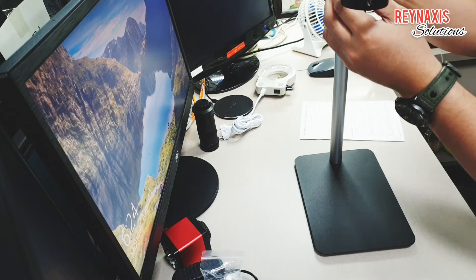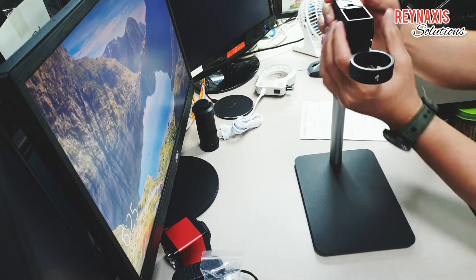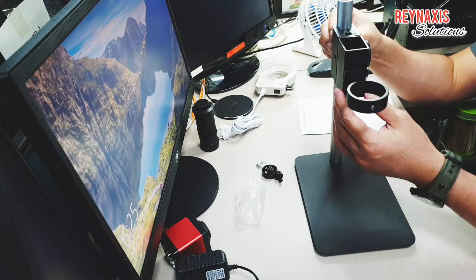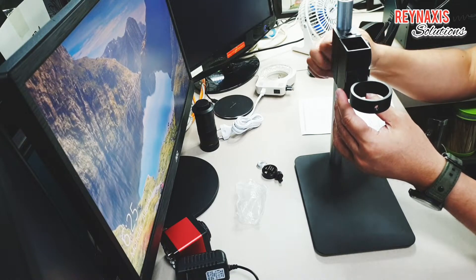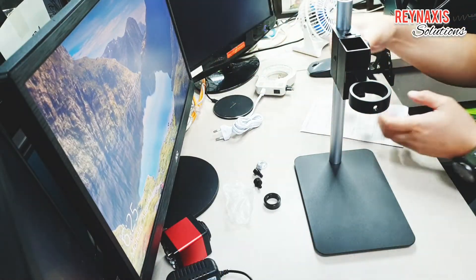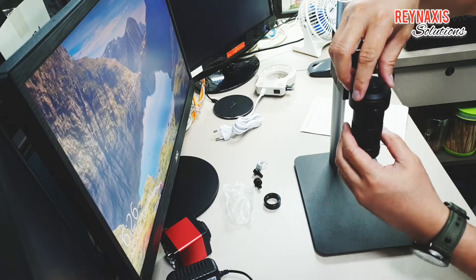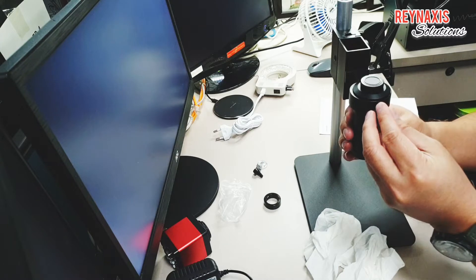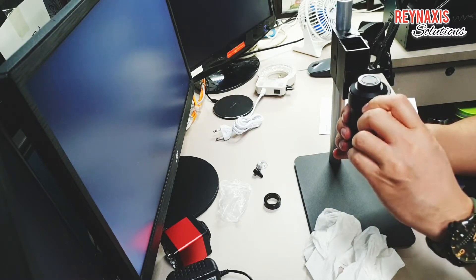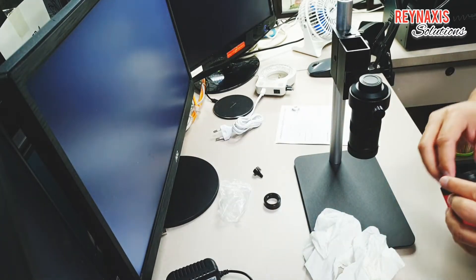Let's put the microscope holder first and slide it down through the pole, and we will use the screws that come with it to secure it. Next, we're going to insert the lens or the microscope lens and secure it with the screws provided. There are only three screws here, so if you lose one you might have to ask the supplier.